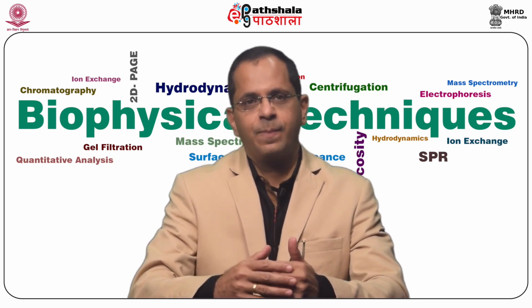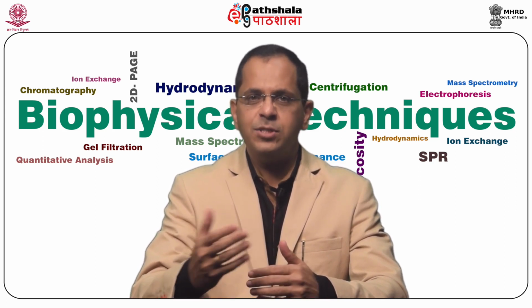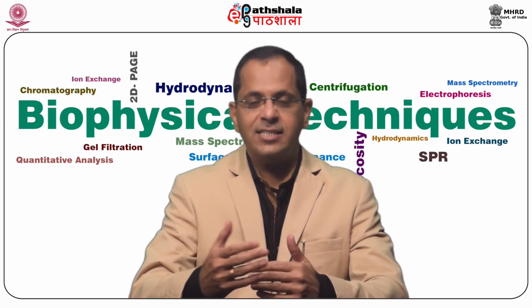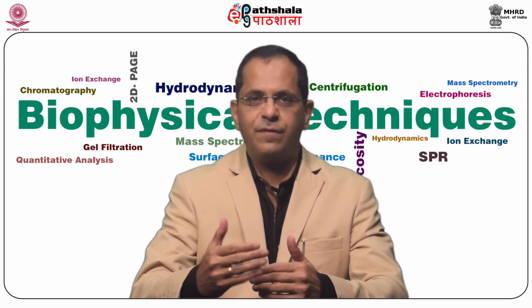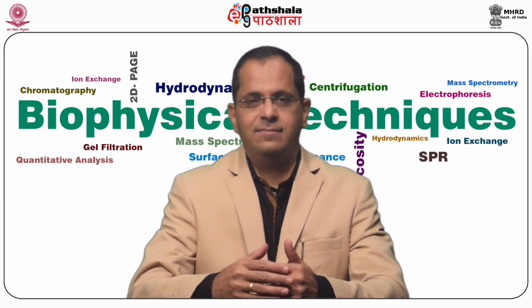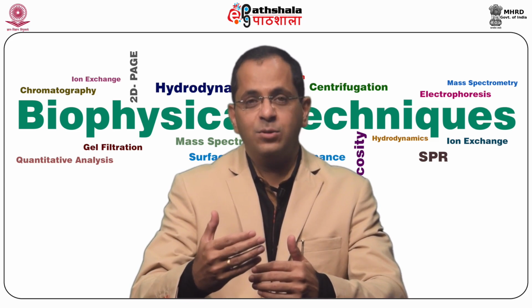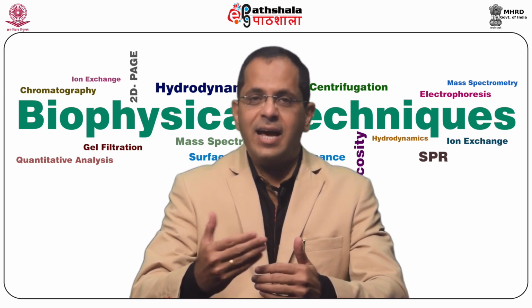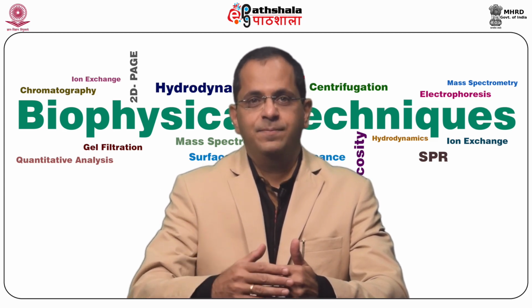introduction. This particular technique, that is SDS PAGE, is widely used in the fields of biochemistry, forensic medicine, genetics and molecular biology. This particular discontinuous system of SDS PAGE was first introduced in the 1970s. This has more than 227,000 citations as of today, with an annual average of more than 3,000 citations.